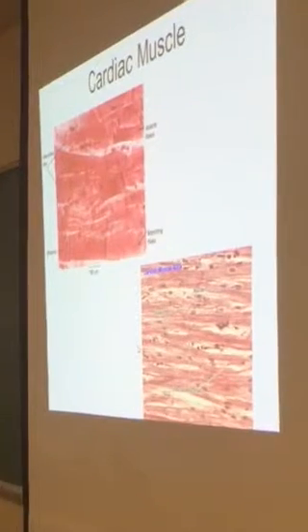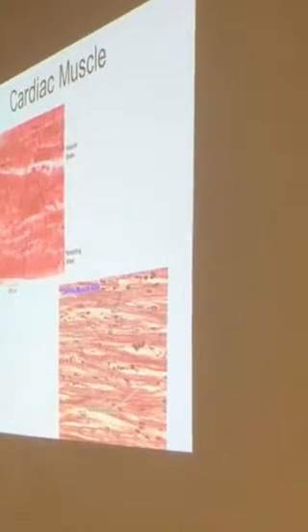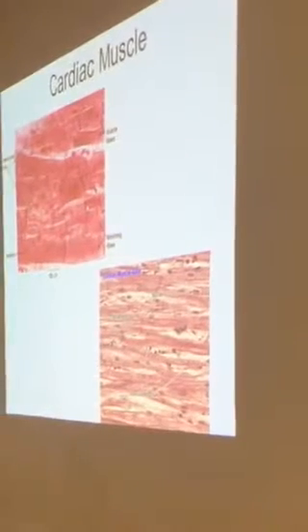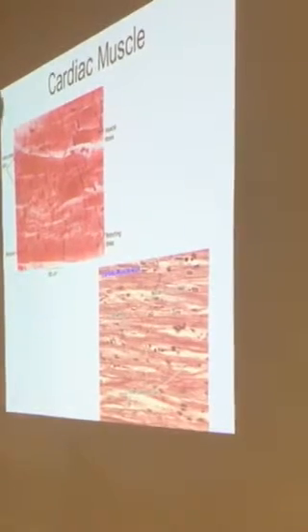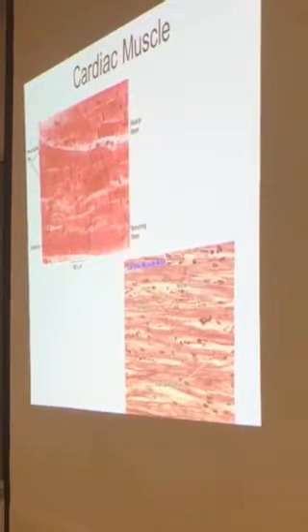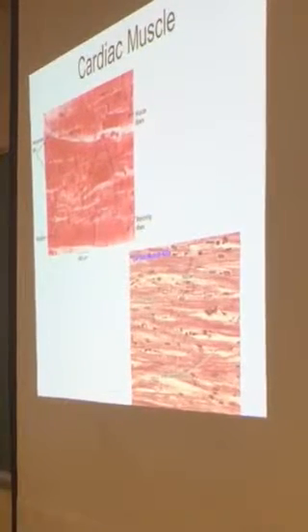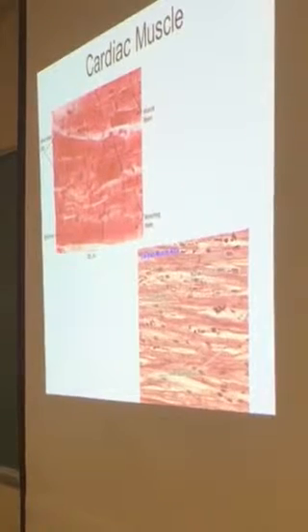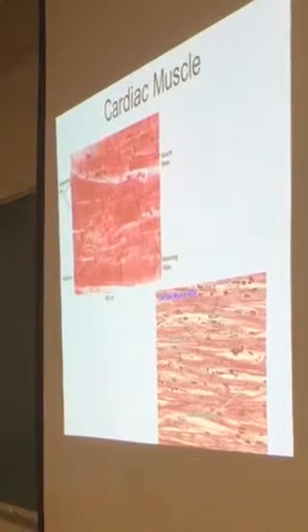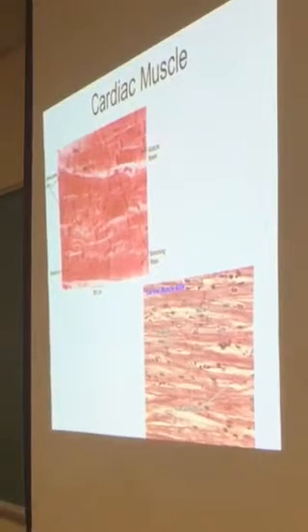This is cardiac muscle. And its biggest difference is your intercalated discs. So if you see these lines, those are intercalated discs. They are junctions that allow the wave of depolarization to travel through the heart without having to start and stop. It also has striations, and it is what they call branched. So if you looked at your skeletal muscle, there were pretty much parallel fibers. Your cardiac is not that way. It tends to branch, but your biggest thing you're looking for are those intercalated discs.